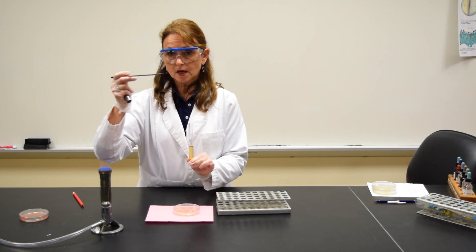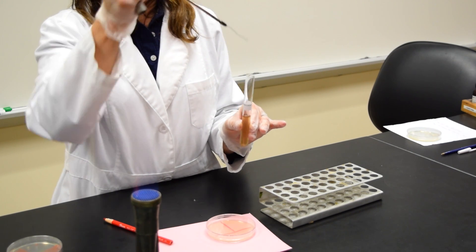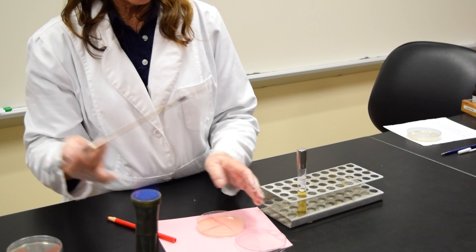You're going to remove the cap of the tube, put the loop into the broth, remove it, and immediately put the cap back on the tube. Then take the lid off your petri plate.